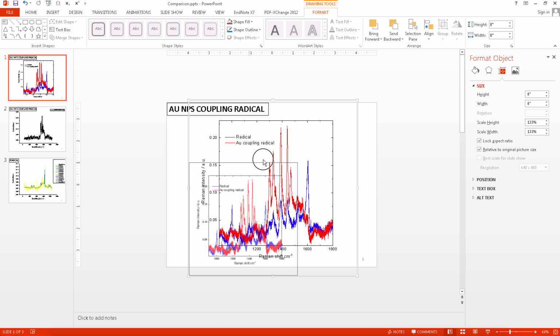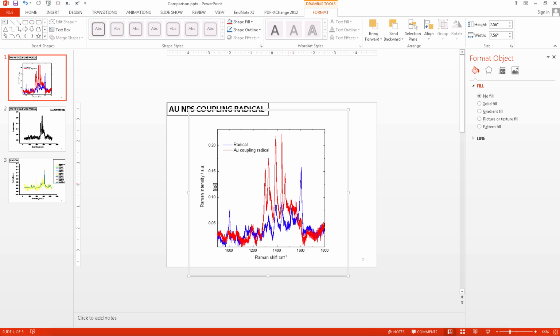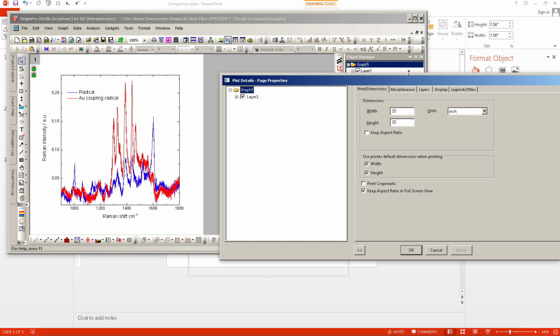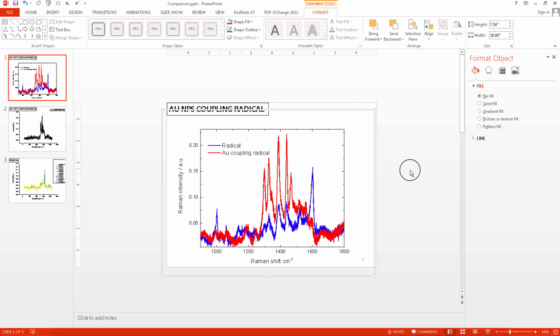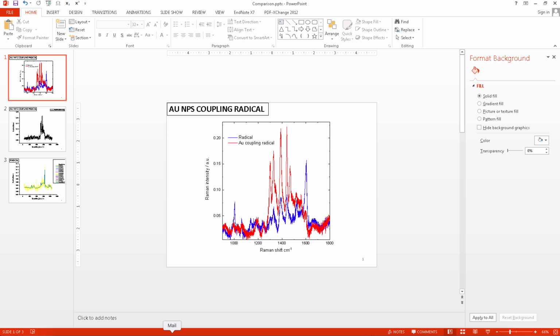The way you want to resize it is like this, and if you want to change the aspect ratio, now it's going to be longer. I'll explain this to you, but it is important that you don't make an awful thing there. You open it, press F2, and here you change it. You can change the aspect ratio. If you want to make it wider to see the peaks more distinctly, then you change it like that. Okay, do not change it the other way around. And the other thing, once it happens there, you can just press Ctrl Z and you come back to the original. Okay, hope this will help you to process the data.